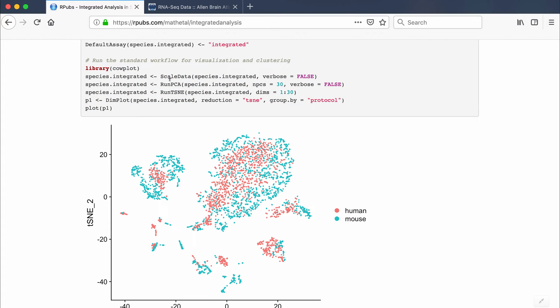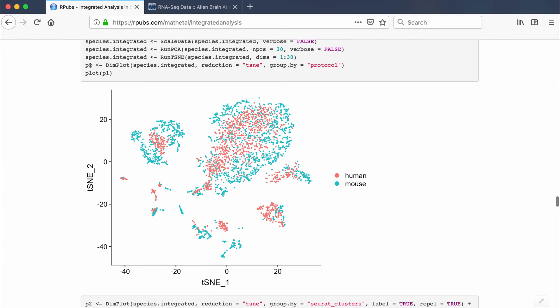The next line of code analyzes the integrated object: we scale the data, run PCA, run t-SNE, and then plot the t-SNE. The group.by command splits and shows differences based on 'protocol' — labeled as human and mouse. Plotting this produces a t-SNE plot separated by human in red and mouse in blue.